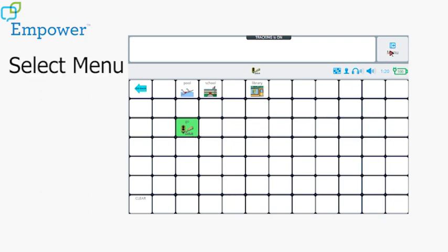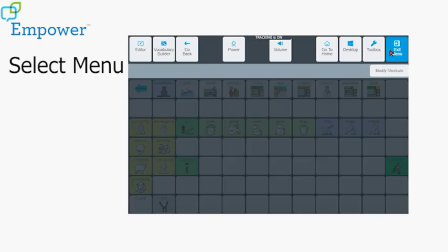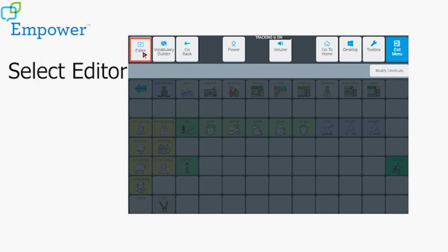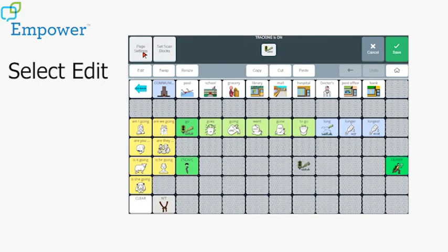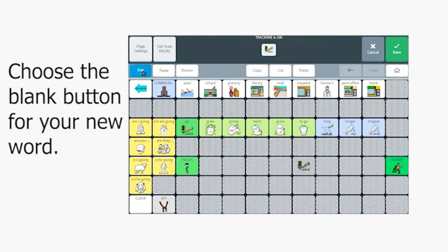To do that, I select Menu, Editor, Edit, and I choose the blank button where I want to put my new word. I'll put it here.